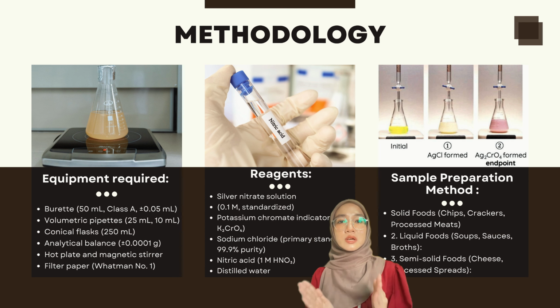The procedure breaks down solid food structure through homogenization, then uses hot water extraction to dissolve sodium salts. The 80 degrees Celsius temperature enhances extraction efficiency by increasing solubility and breaking down protein-salt interactions. Filtering removes insoluble particles and dilution to a fixed volume allows for accurate concentration calculations.